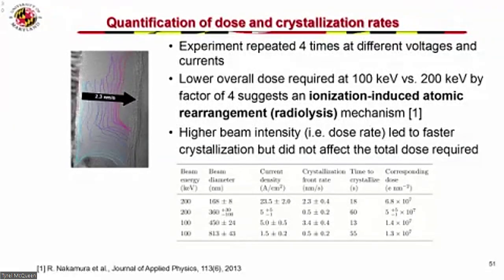That would be good, but our beam in TEM mode, because this is 60 nanometers thick, maybe, I don't know what would be the smallest spot size in TEM mode. In STEM mode, we can make it much smaller, but this was all in TEM mode. So to answer your question, we didn't do that. Here, this is an aluminum contact on this side.